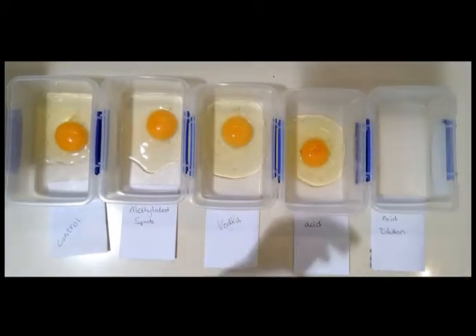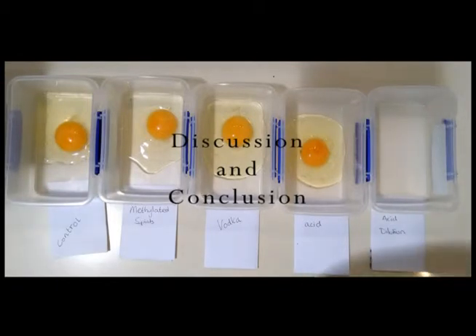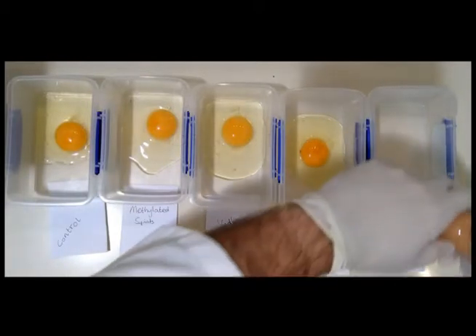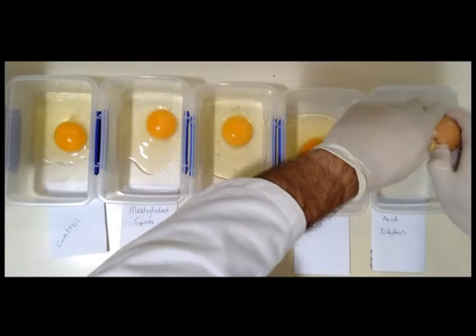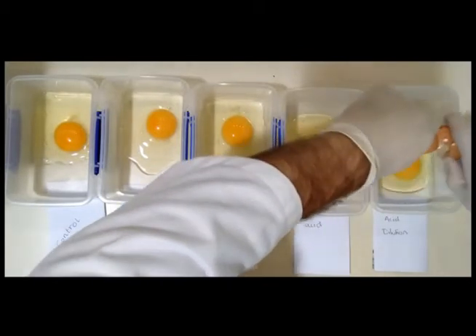Discussion and conclusion. The results indicate that the hypothesis was supported. Protein denaturation by 90% ethanol is most effective in this experiment, due to the way in which alcohols denature proteins compared to the way in which a change of pH or a change in temperature denatures proteins.